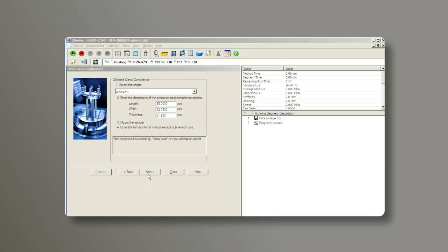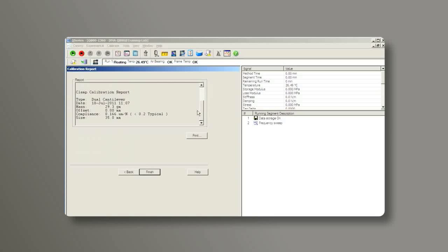After the calibration, click on Next and check the calibration report. Make sure the compliance value is lower than the maximum value which is shown on the right side of the screen. You have now finished the Dual Cantilever Clamp Calibration.